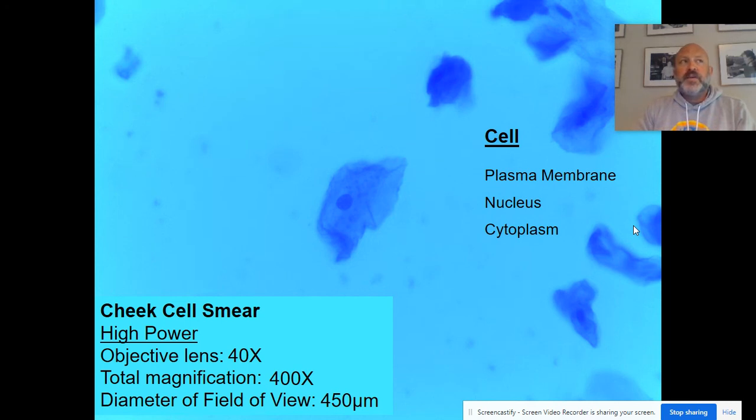It's kind of like estimating the size of your car by knowing the length of your garage, right? If you have a garage that's 20 feet across and you put your car in there and you estimate that you could fit 4 cars in this space, well, then I could figure out the width of my car. I'll go 20 feet divided by 4, right? Which is 5 feet. You would estimate that the width of your car is 5 feet. We're doing the same thing here. This is kind of like the size of a room.